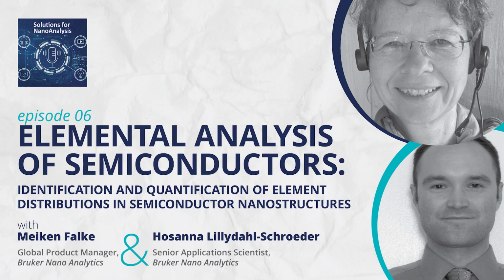And when we talk about TEM, we need to relate EDS to EELS. That is important. So EDS is energy dispersive X-ray spectroscopy. EDS, or some people like to call it EDXS because it has 4 letters like EELS. It uses the characteristic X-rays emitted from an ionized atom when the empty energy levels are filled again. And with that, very distinct sharp element lines are formed. These are the characteristic X-ray lines, and they sit on a very low Bremsstrahlung background.